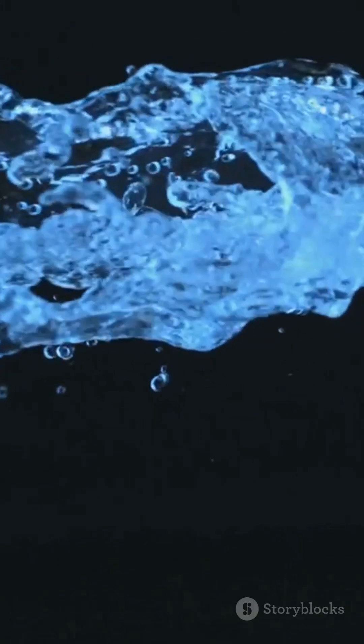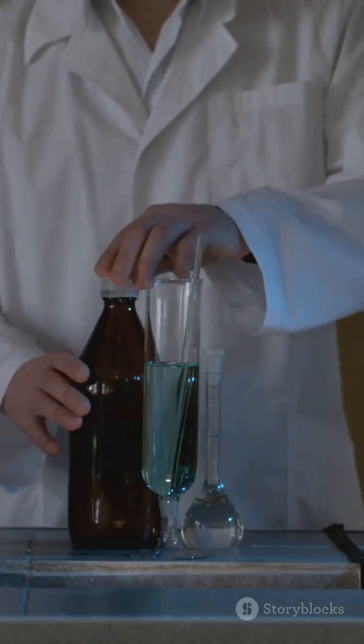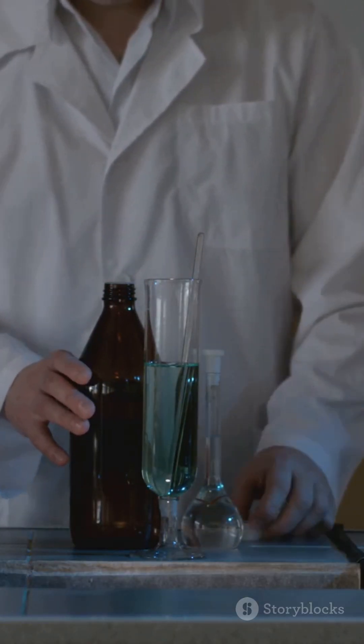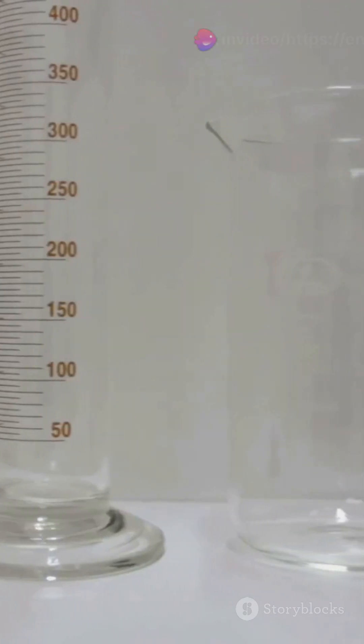So, how does it work? Suspended particles in water scatter light. The more particles, the cloudier the water and the less light passes through.